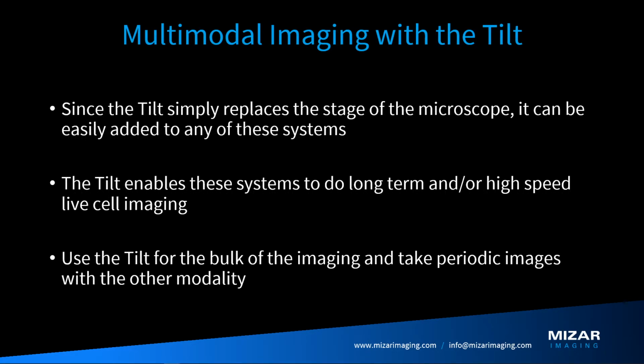But remember, the tilt can be installed onto any of these microscopes. We simply replace the stage on the microscope. And then you can continue to use our stage for the applications and imaging with these other modalities. So now, by adding the tilt onto these systems, you can do long-term and/or high-speed imaging. In addition, work in some of these other modalities.